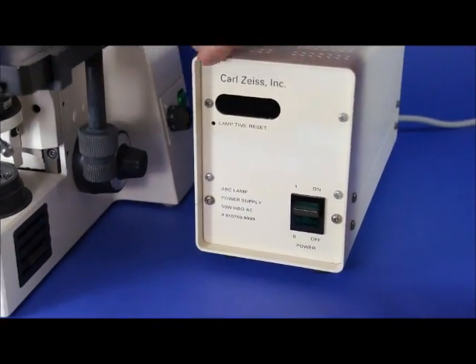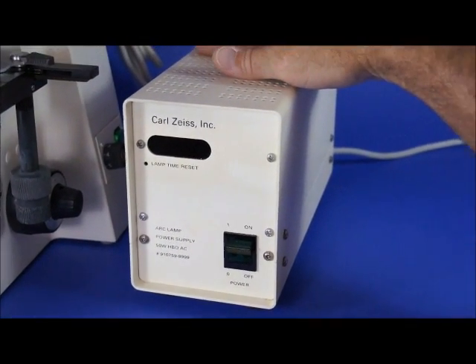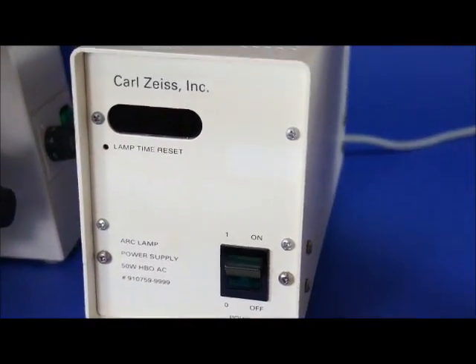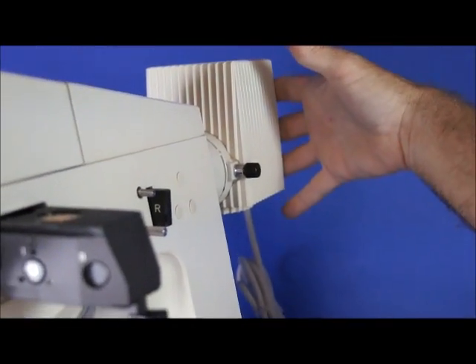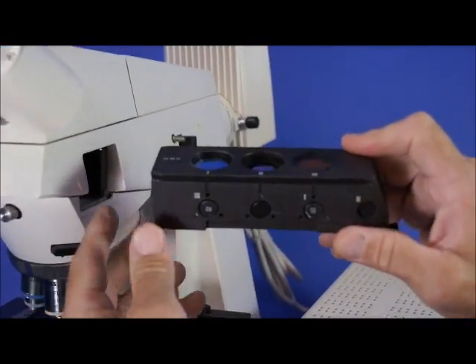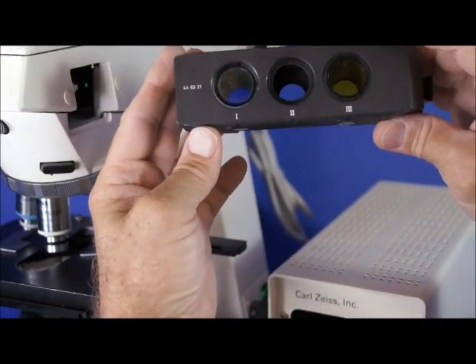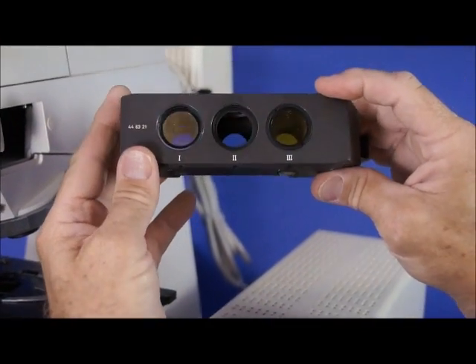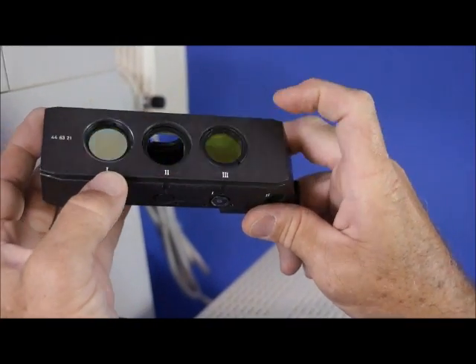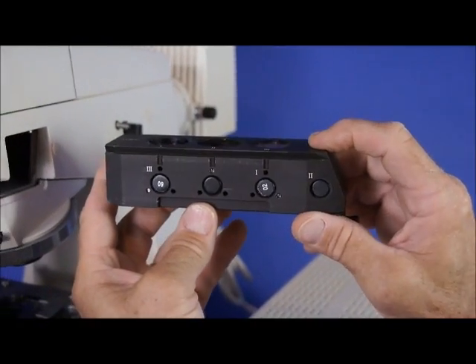Moving over to the right side, you can see the fluorescence unit. It's a 50-watt HBO power supply, and it works in conjunction with this 50-watt mercury lamp housing that's back here. Moving to the front, there is a set of epifluorescence filter cubes. I believe these are set up for DAPI, which is low UV, and fluorescence FITC, which is mostly for FITC, which is fluorescein isothiocyanate.